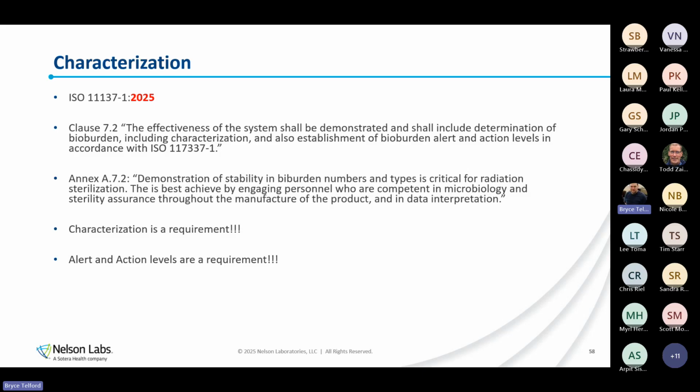So a common way to do characterization might be to do a gram stain of the top 3 predominant isolates. That's going to give me a higher level gram stain. It's not the most expensive approach. And that's going to tell me what is predominantly on my product. I'm going to be able to see, do I have mostly gram-negative rods? Do I have mostly gram-positive cocci? And I can see how that's changing in general over time. But then I might want to dig down a little bit and add on to my identification something along the lines of identify any pink, red, or orange colonies detected.